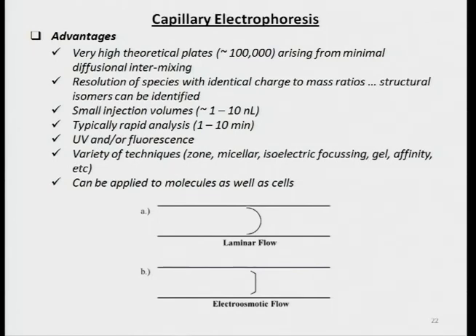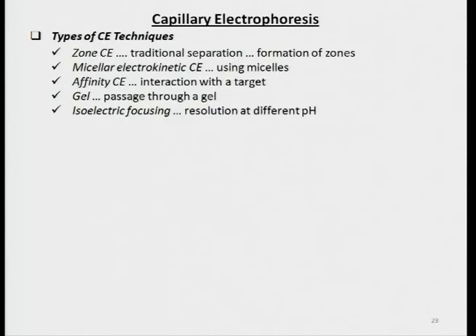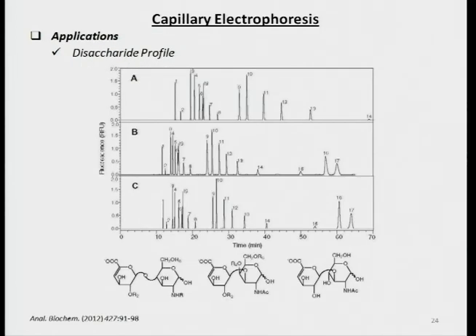If you have a technique where you can label it, if you have a protein expressing green fluorescent protein, you can actually monitor it. That's in the works, in the sense of being developed. Okay, so let's skip it because I don't really want to discuss all of the different techniques. But here's the power as far as GAGs are concerned. And you're going to do the CE experiment on Friday, one of the CE experiments.